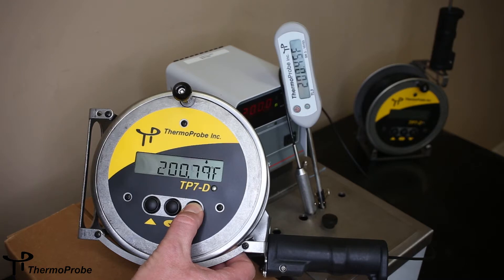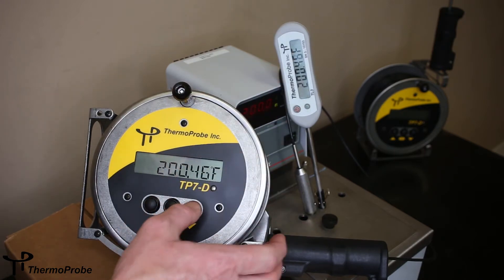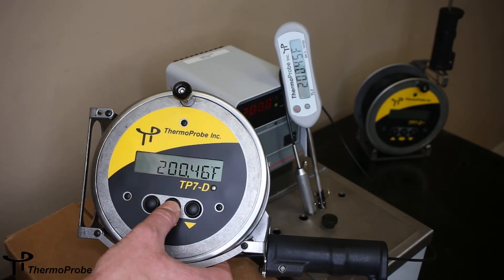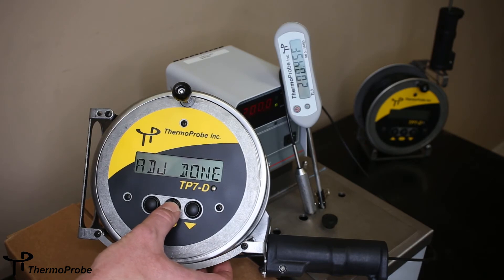Bring it down. We adjust back and forth until we settle on 200.46. Once we're happy that those two match, we hit select, we get a save prompt, and we confirm that by selecting again. It says adjustment done — we hit select on that.